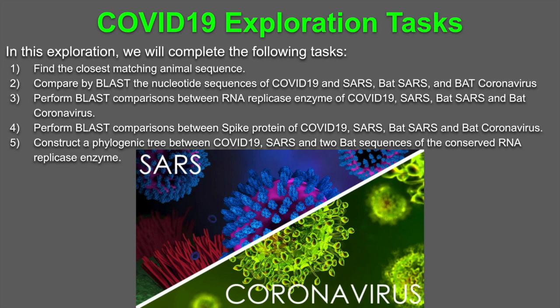Third, we're going to perform BLAST comparisons between the RNA polymerase enzyme of each of these viruses. Fourth, we're going to compare the spike protein found in the viruses. And then lastly, we're going to construct a phylogenetic tree between the four viruses.